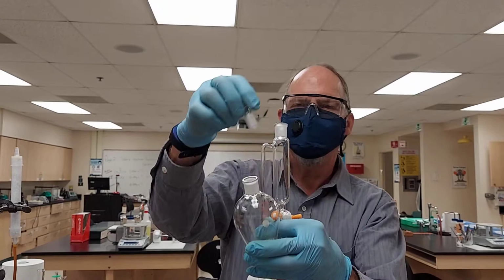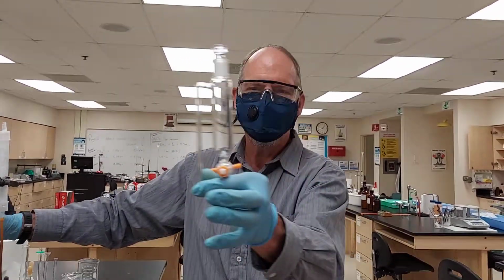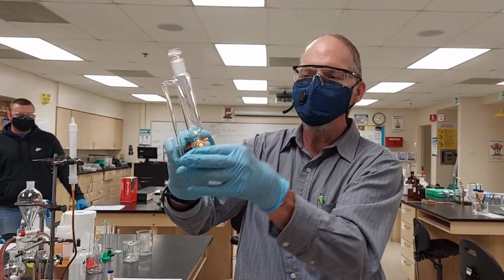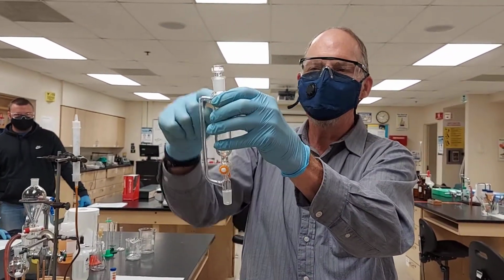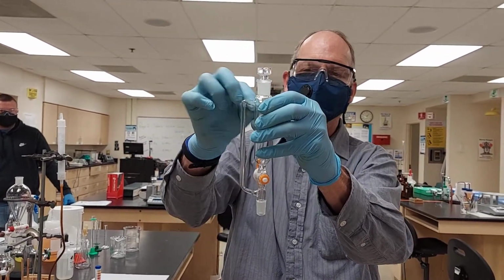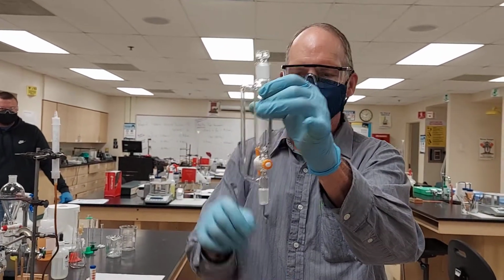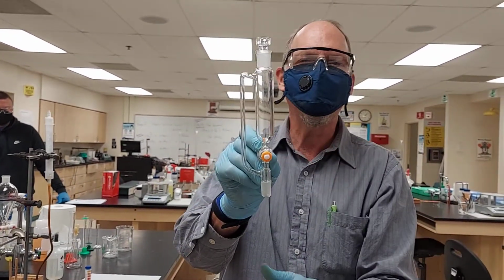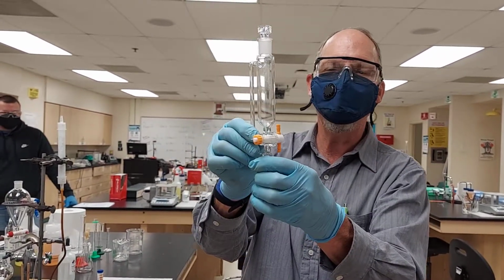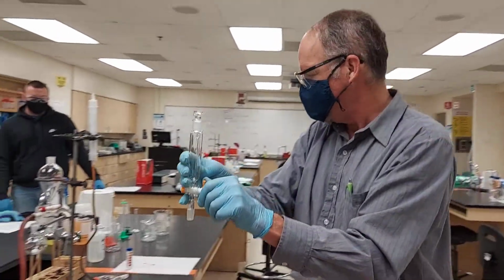This device over here has some clever engineering. I can leave this stopper on and pour the liquid out, and a vacuum does not happen up here because air goes back this way and equilibrates the pressure. This is called a pressure equalized dropping funnel. And this here is a 30 milliliter pressure equalized dropping funnel.